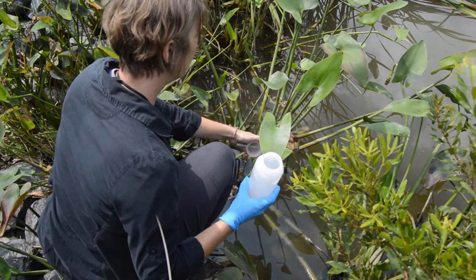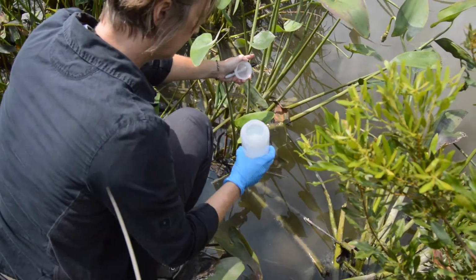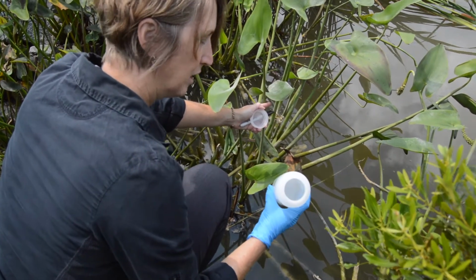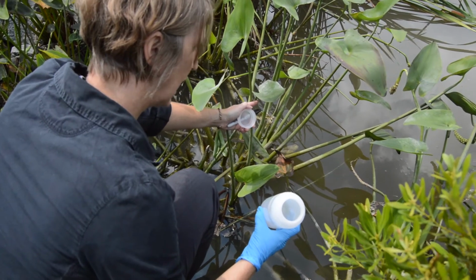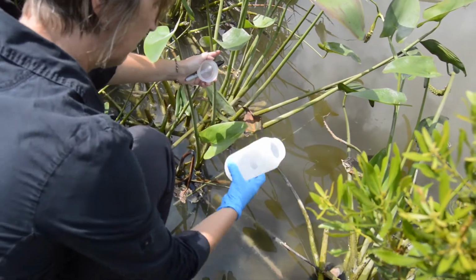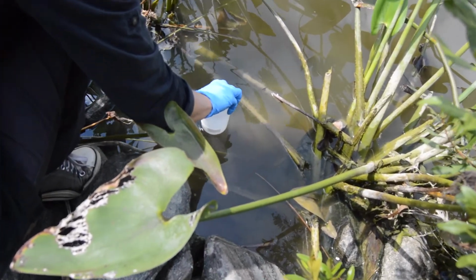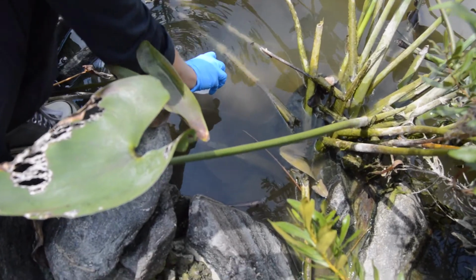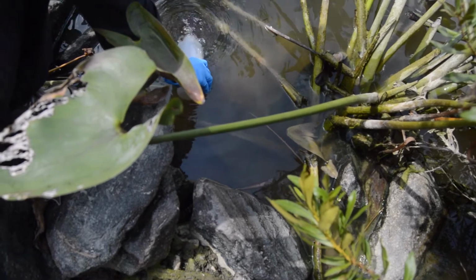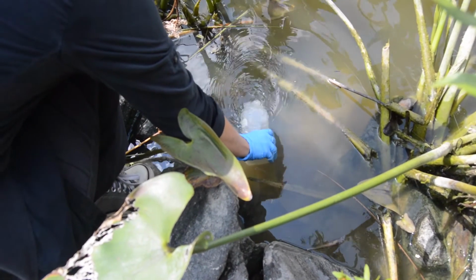From a pond, we generally want to avoid getting surface water. There's stuff that floats on top, and so we want to get the opening of our container below the water before we tilt it, so that we can start collecting our sample. So we put it in straight down and make sure that it's completely submerged before we tilt it to the side, and let our sample get in there.